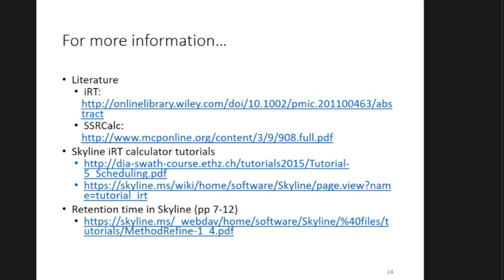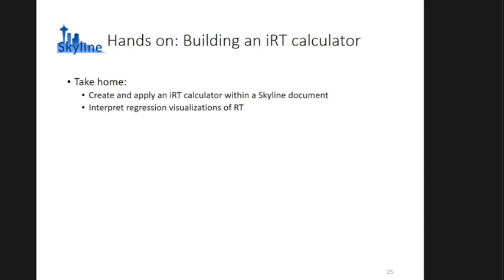So in the slides, when you get the slide deck, I've just got bonus information if you are an A+ student and really want to go impress your lab, but I will turn it over to Brendan to show you how to make an IRT calculator in Skyline.